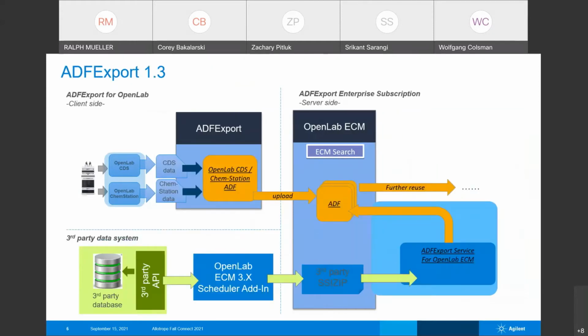So let's come to the ADF Export 1.3 with its two products, starting in October. On the upper left, you see the ADF Export for OpenLab client side. We are also managing this with this release with an update on the framework, but also adding SFC support.